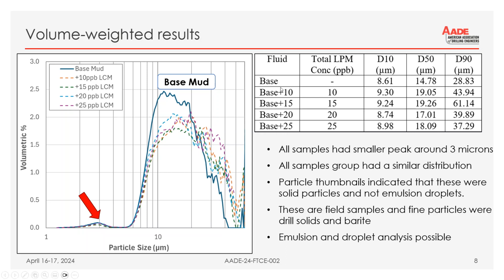We took the base fluid, and then we added additional quantities of the loss prevention materials. And definitely you could see that there are similarities. When you look at the increases over time, looking at the base mud and then working with these added materials, you see that you start getting a little bit of a shift over. Again, when you're working with laser diffraction and size-only techniques, you're kind of reading the tea leaves, right? You're trying to see what's going on based on a histogram and some data.